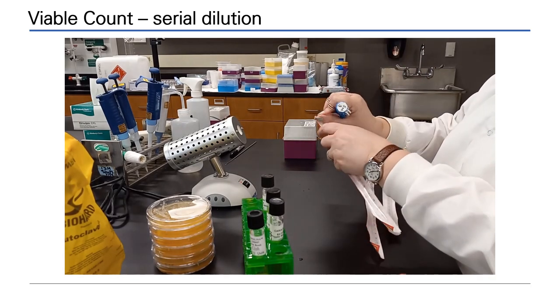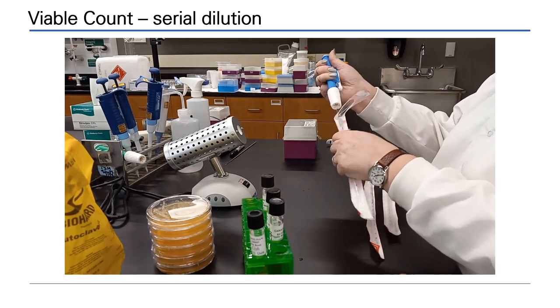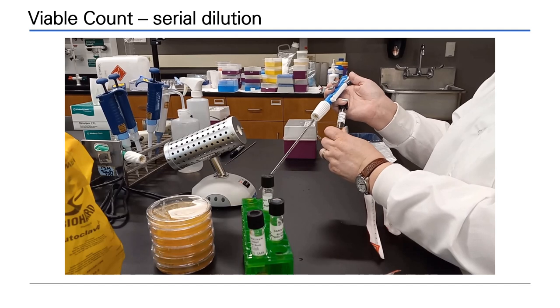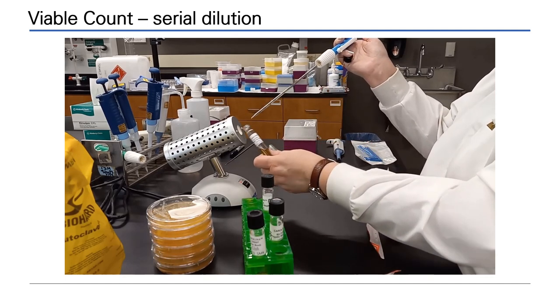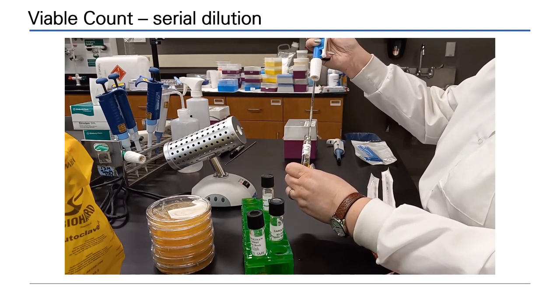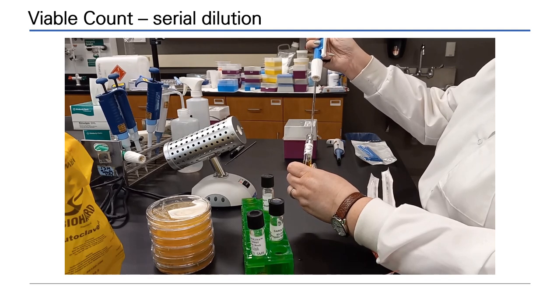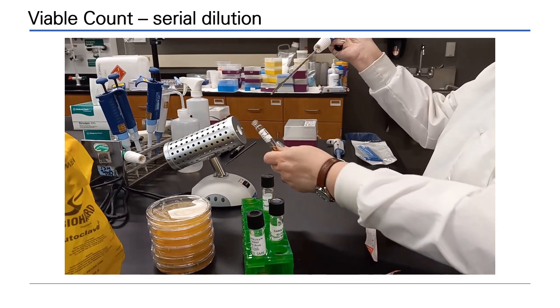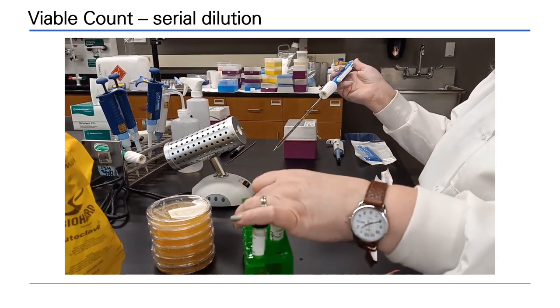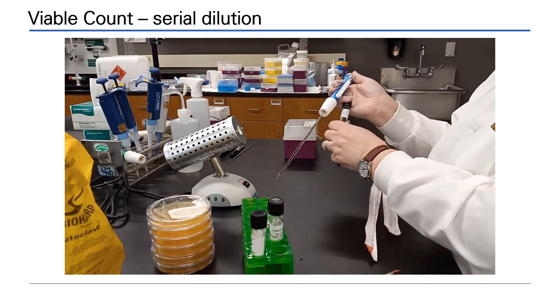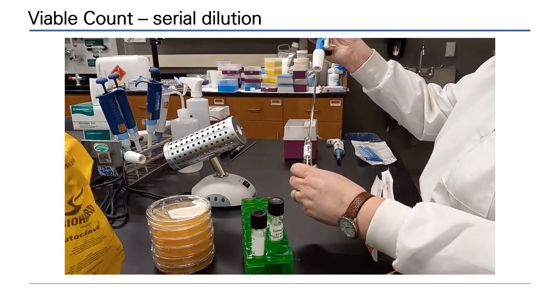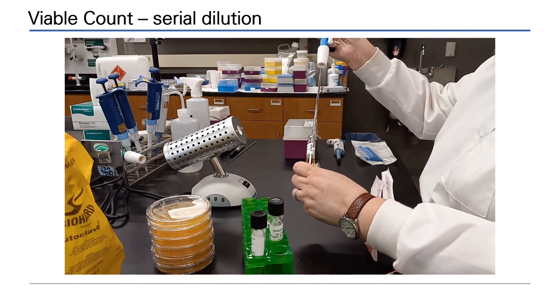Work tidily. Remove wrappers to the side. With the fresh pipette, make sure you pick up now the 10 to the minus 2 dilution tube. And again, remove 1 ml. Transfer the ml into the 1 times 10 to the minus 3 tube. Remember, this contains 9 ml. You are adding 1 ml. That is a series of 10-fold dilutions, 1 in 10.